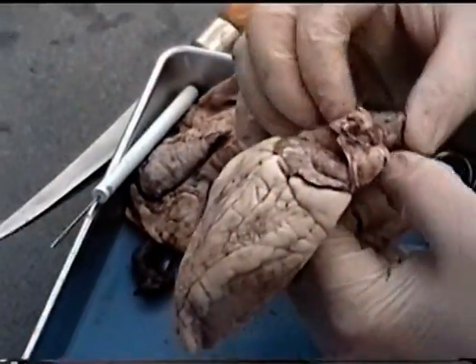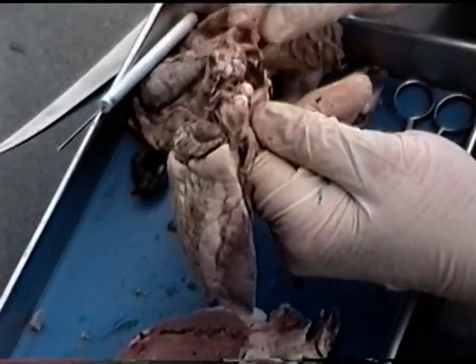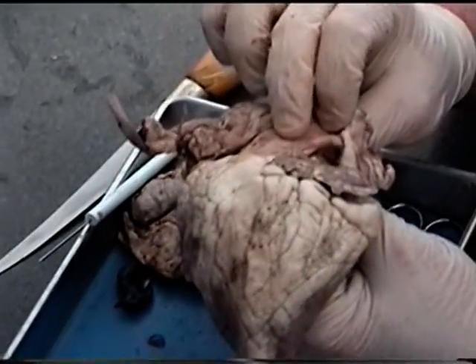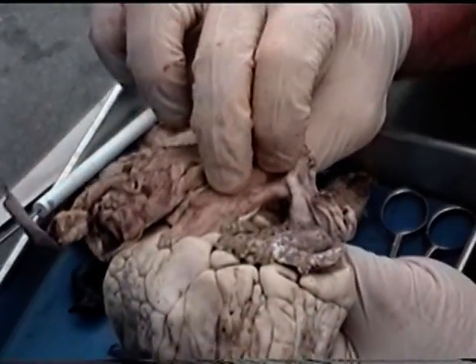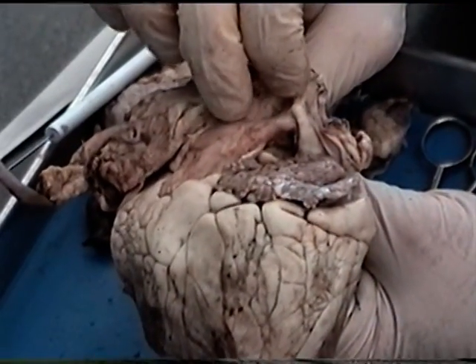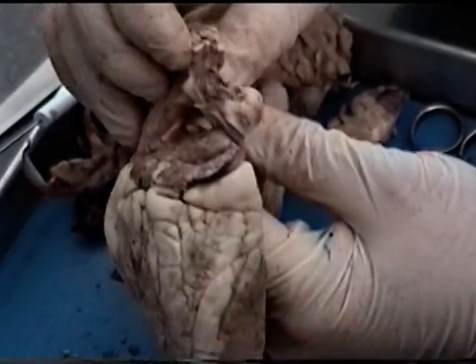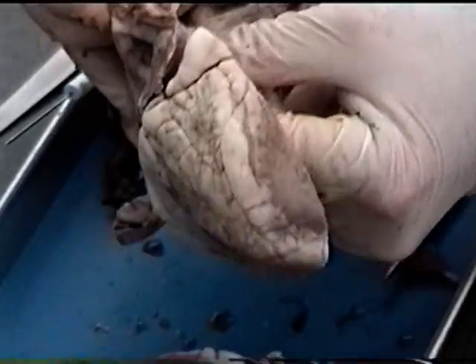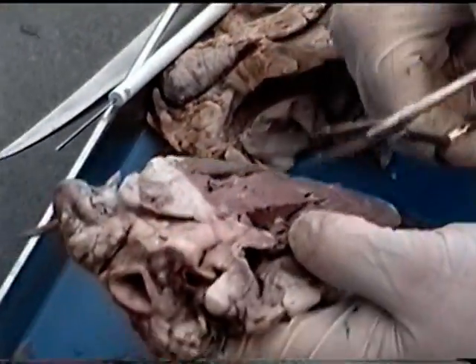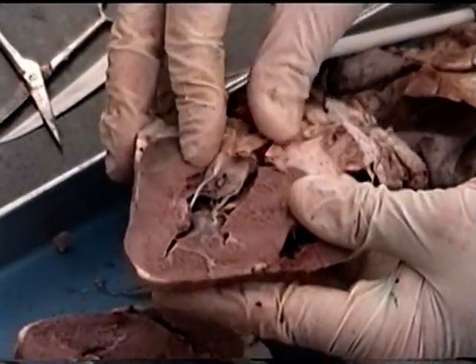So sometimes what you can do is you can feel your pulmonary trunk here, you can feel your aorta, and you can actually feel the ridge of tissue right here. There's a ridge right here we can feel, which is our ligamentum arteriosum that we talked about, the remnant of the blood vessels that used to connect the pulmonary trunk to the aorta itself. Now what I'm going to do is I'm going to cut up through the aorta so that we can separate that tissue. So what we did is we just cut the aorta so we could pull it apart.